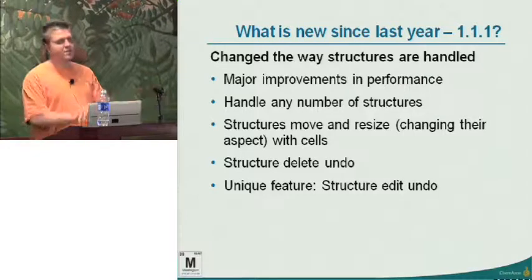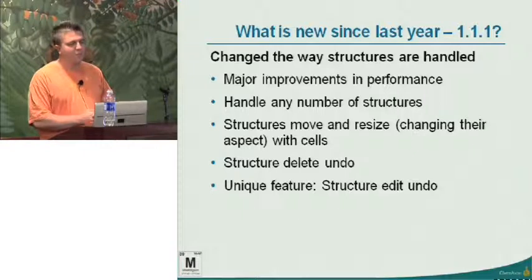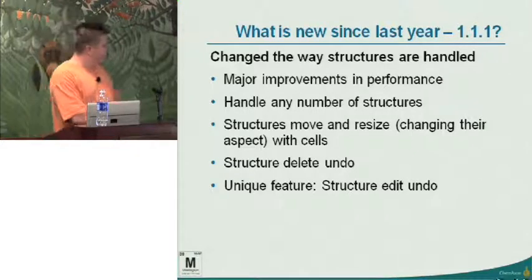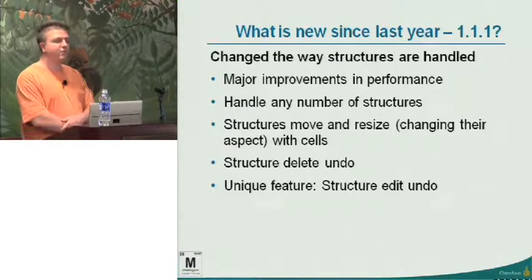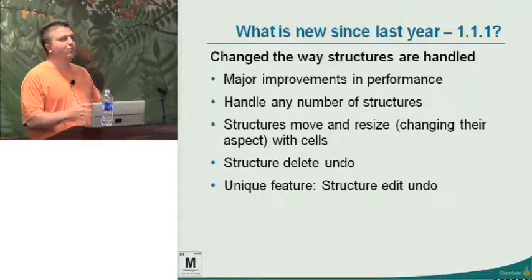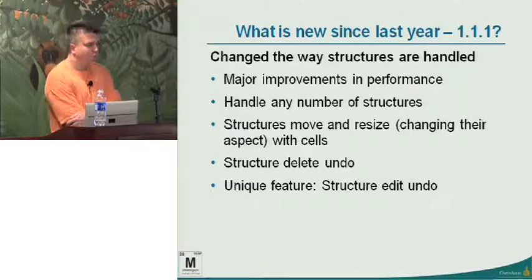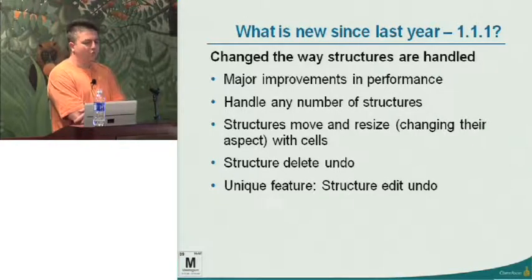The hardest part of this Excel-related development is to make the architecture of the application and to find out how to handle these structures inside Excel. Compared to the first versions, we made quite big changes in this. We use a different approach in Excel to put the structures in. Actually, we don't even put them in. We simply draw on the Excel window. That results in major improvements in performance, for example, in import speed and doing any kind of operations.